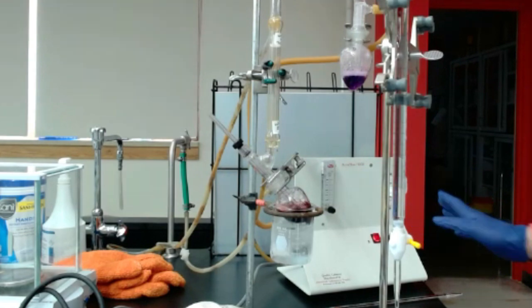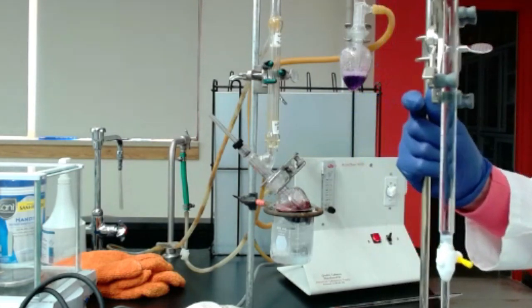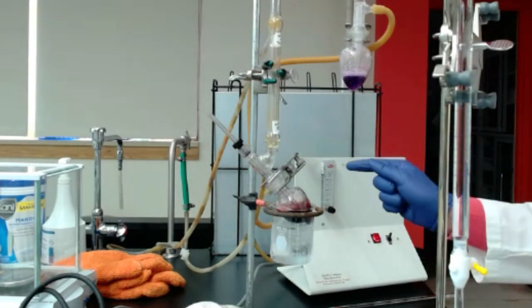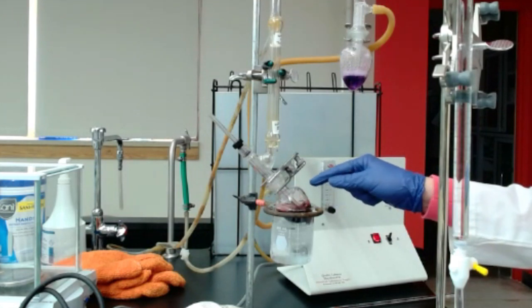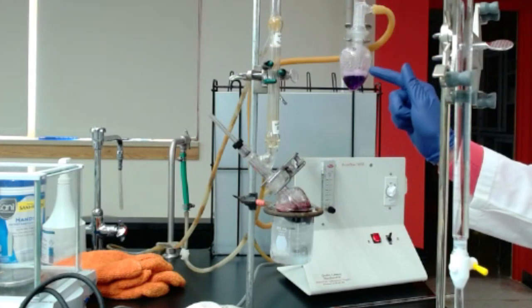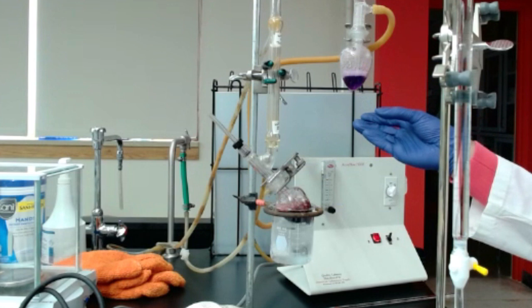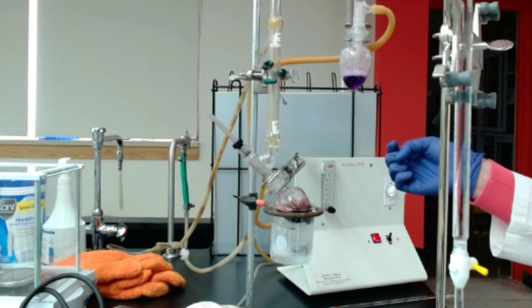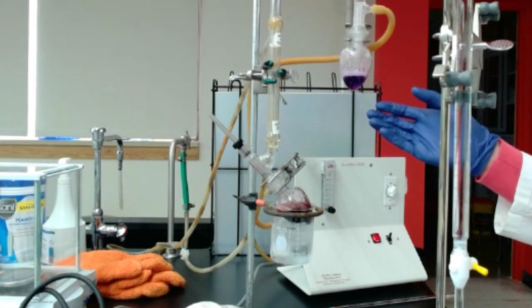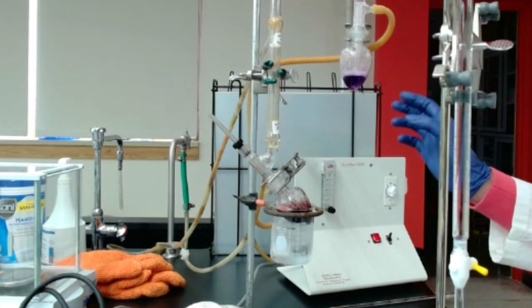It's almost done. I think we have 1 minute on the timer before the free SO2 is complete. So while it's finishing, just a few things that can happen. Free SO2 is measured by the amount of SO2 that is transported here and reacting with the hydrogen peroxide solution to form sulfuric acid. So we're looking at how much sulfuric acid is obtained. But in a wine that has a lot of acetic acid, that's also a volatile acid, and so if you have too much acetic acid, that might interfere in the titration. So that's one thing you don't want, too much acetic acid, or at least know how much acetic acid you have initially.